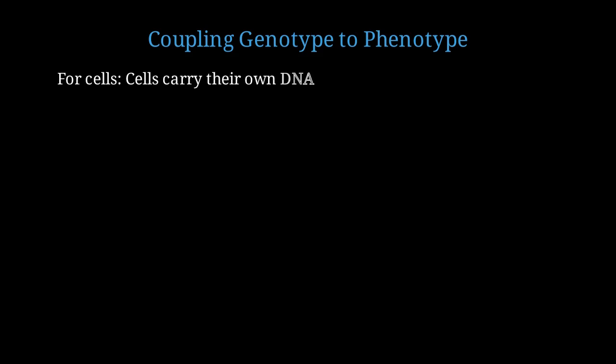The entire directed evolution campaign took only 2 weeks. Using traditional methods with microtiter plates, this would have required at least 2 years of continuous work. A critical question arises. After we sort droplets based on fluorescence, how do we recover the genetic information from the winning variants? For cell-based systems, this is straightforward.